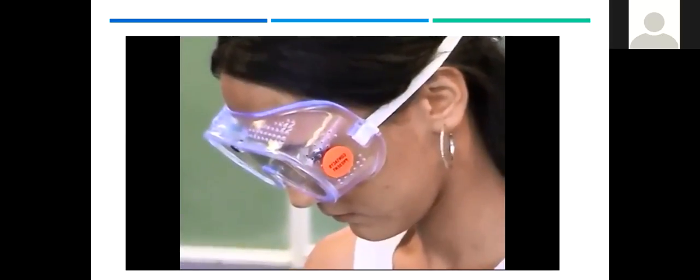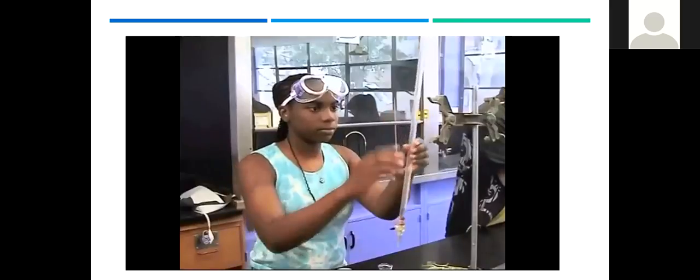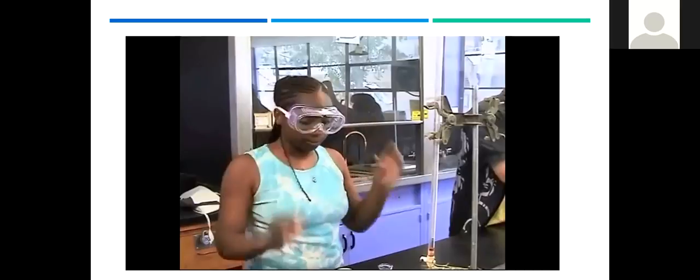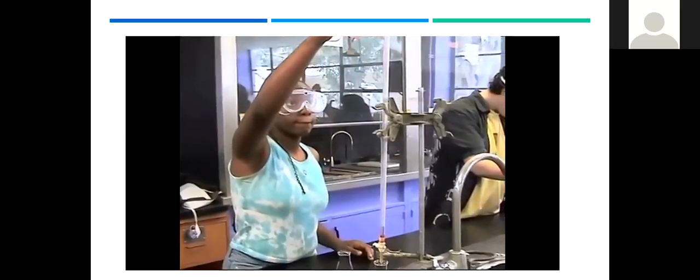If you wear contact lenses, put a sticker on the left side of the goggles so that in the event of an emergency, the people helping you will realize that you are wearing contacts. Always wear your safety goggles, not dangling from your neck, not covering your forehead, but over the most vulnerable part of your body, your eyes. Following these important rules will help to make your experience in the laboratory both safer and more enjoyable.